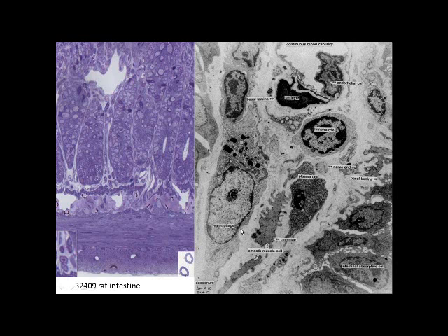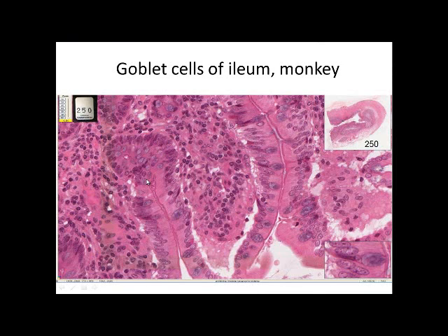And this is a smooth muscle cell. So these are smooth muscle cells here and here. And this is a smooth muscle cell as well. There's another one right here. And then these are the epithelial cells. So these are these cells right in through here. So we're talking about right in through this region is where you have the blood vessels, and we see a blood vessel there because the blood vessels are in the connective tissue. They're not in the epithelium itself.